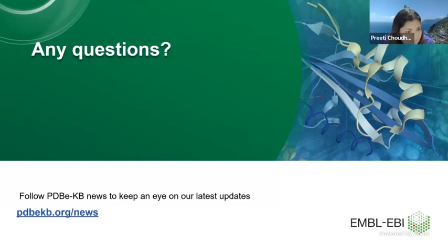Thanks, Rahul, for your question. At the moment, you can only filter based on taxonomy using the search field, which I showed in one of my slides. But among those, we don't have exact sequence identity associated with it. But all the structures which you see are generally more than 90% sequence identity.